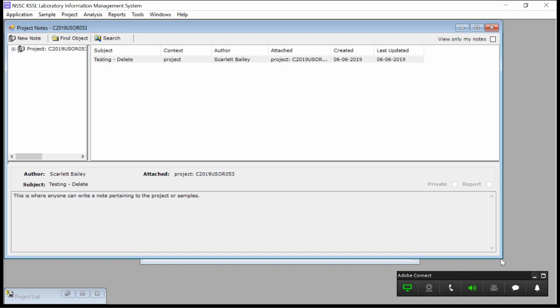Like sometimes samples may get lost in shipping or open in the bag. Then they would indicate that here. Maybe the clods were too sandy for analysis, were falling apart. The lead physics technician will make a note here. So you can kind of see what was going on.